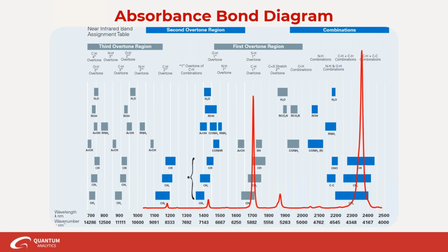What you have to do is build chemometric models. You develop those using reference values for the chemical and the physical parameters of interest, the near-infrared spectra that you collect, and then there are calibration techniques that you use. Two examples: principal component analysis, which is used for classification, detecting an outlier if there's something strange about a sample.